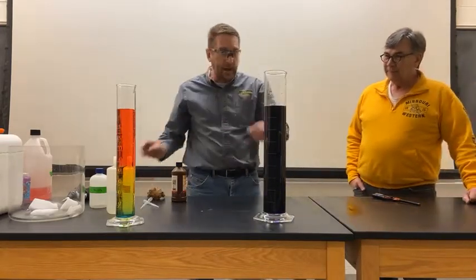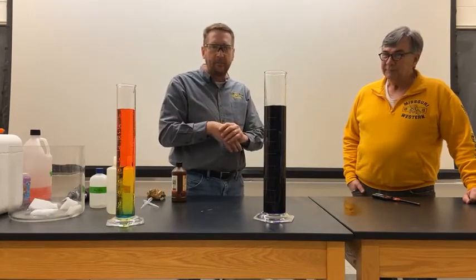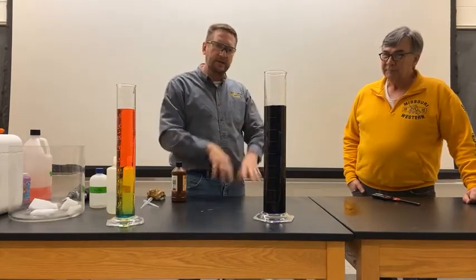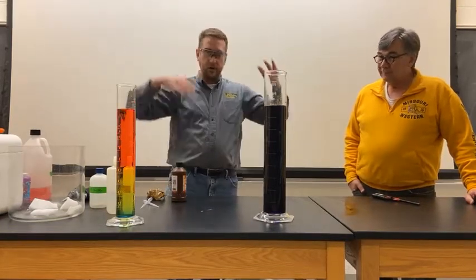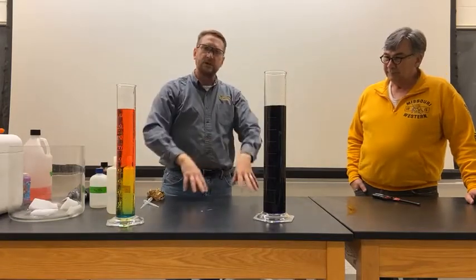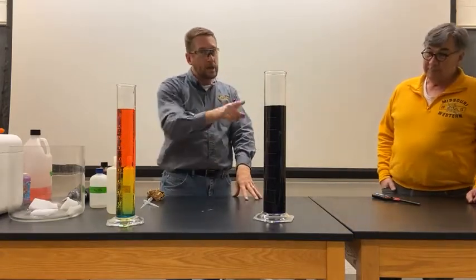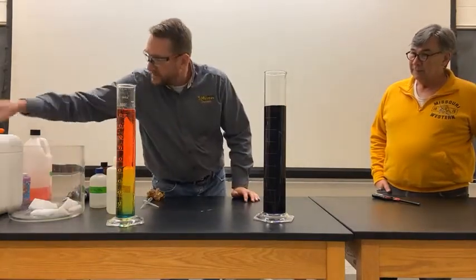So I'm going to put a piece of dry ice in here. And the reason we're going to put some dry ice in here is I want you to see what happens when carbon dioxide dissolves into water. Because again, this is one of the concerns that we have with increasing carbon dioxide concentrations in our atmosphere, is that more of it dissolves into the water, and when it does, we're going to get effects like we see here.